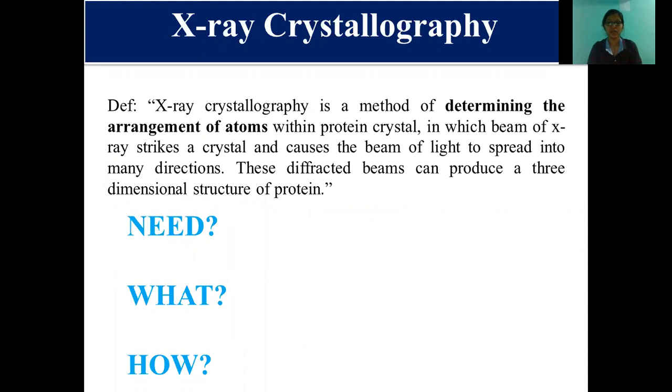Here we will see three more important points. What is the need of X-ray crystallography? What does it mean? And how is it performed? Basically, the technique name itself says that it uses X-ray and it uses crystal. So first it is needed to understand what X-ray is and what the advantages of X-ray are. X-ray is used to identify the 3D structure of protein, and why are crystals necessary to identify the 3D structure of protein?